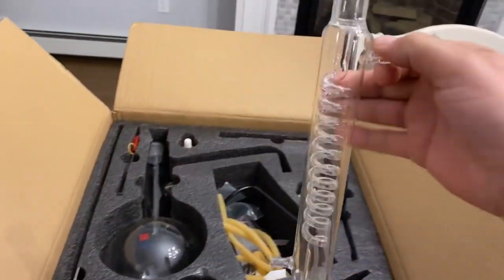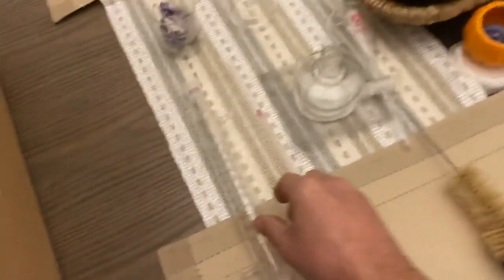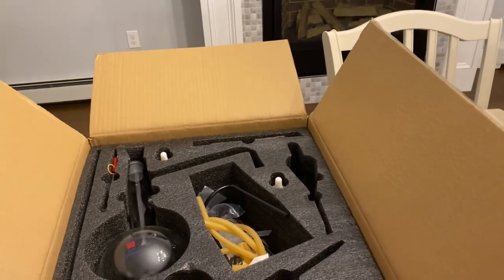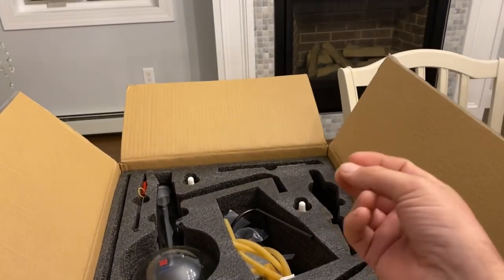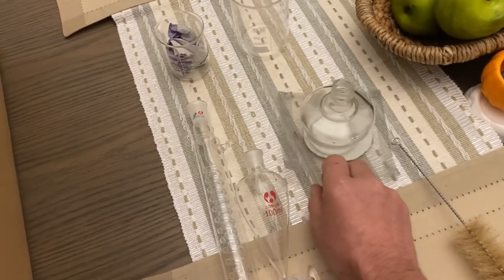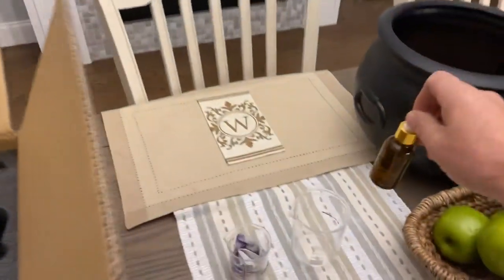This is one of the most important pieces — this is a condenser. In a future video I'm going to show you how, with this system, you can turn any kind of flower or seed into your own CBD oil, cannabis oil, lavender, or gardenia — pure essential oils. You'll be left with two byproducts that separate inside the unit: the CBD oil or whatever kind of oil you want, and water on the bottom which you remove with the valve.